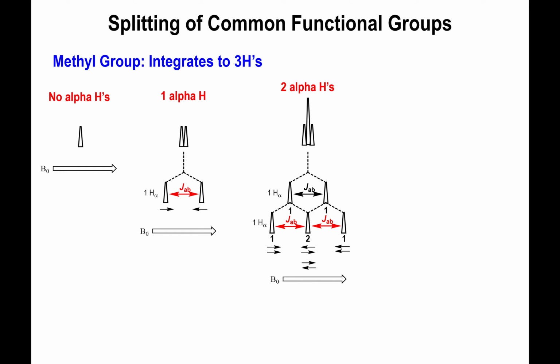And if on the neighboring carbon of this methyl group you have 3 hydrogens, you are going to have just a singlet. Now this may seem a little bit counterintuitive. You may have thought that this will give rise to a quartet. But the thing is, if you have a CH3 right here and next to it another CH3, well, you've got yourself ethane, and there is a mirror plane associated with the carbon-carbon single bond, because these CH3 groups are free to rotate.